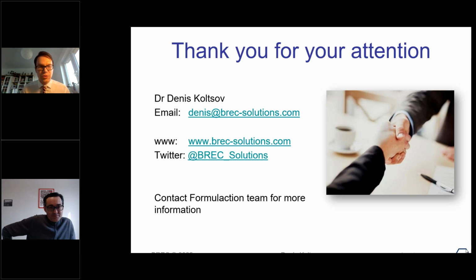It's a give and take. So sometimes in these negotiations, you just have to say, okay, fine, indeed, the document was about that. Coming back to this, yes, there is some comparison, and comparisons are not too bad, actually. As you know, a lot of sizing techniques are basically technique dependent. So if you're measuring it with DLS, you will give a size and then it says DLS, because technically speaking, it's not going to be the same size as you would find in an electron microscope for the same material, because the equivalent diameter is completely different. So comparable equivalent diameters, for example, PTA and DLS, maybe. For SMLS, it's a similar situation, but it's somewhere between the hydrodynamic diameter and the actual SEM measurement. So they're somewhere in between, but they're not far off. I would say maybe a 10–15% range, and so for these particle sizes, it's actually not too bad.